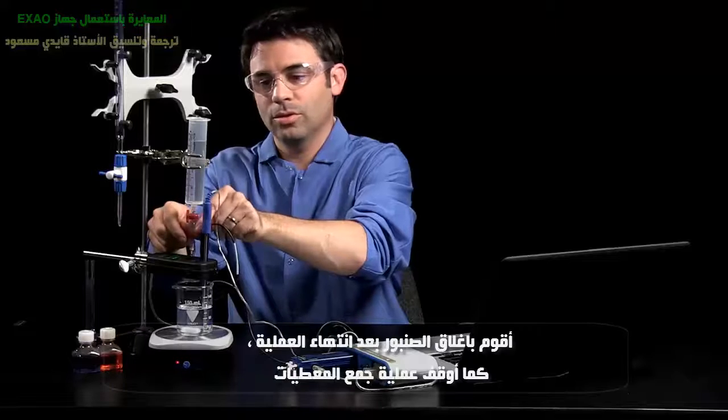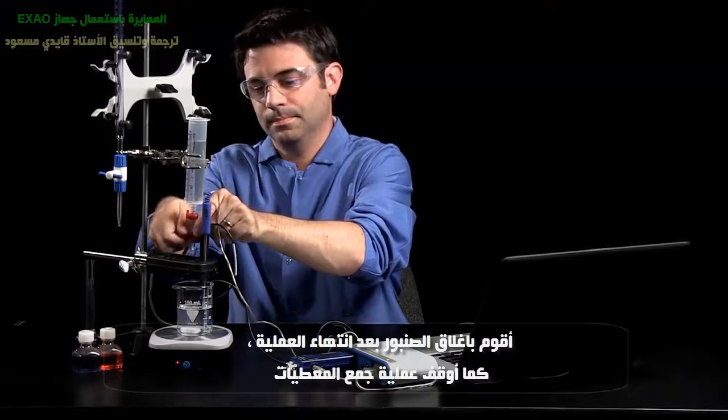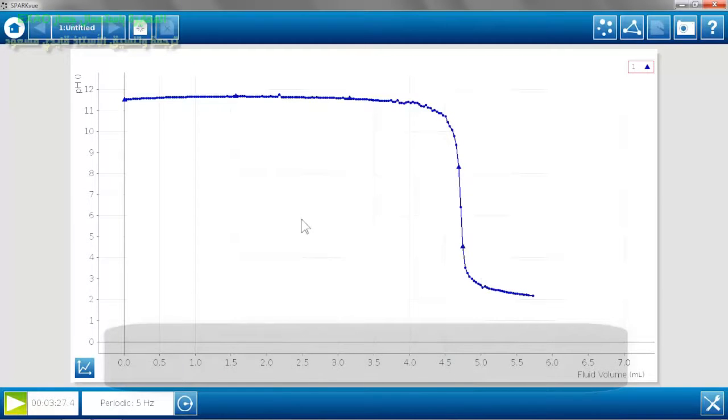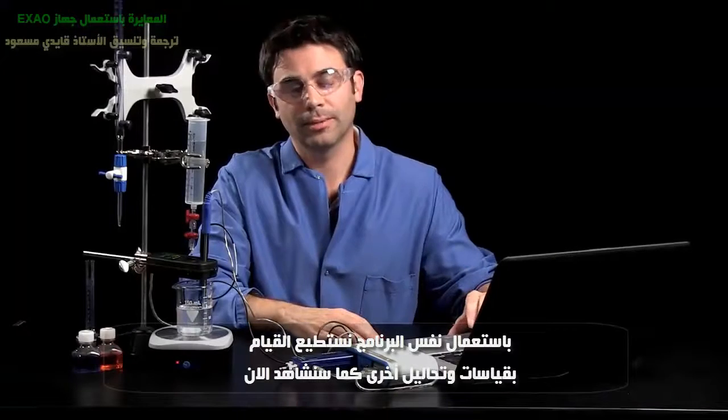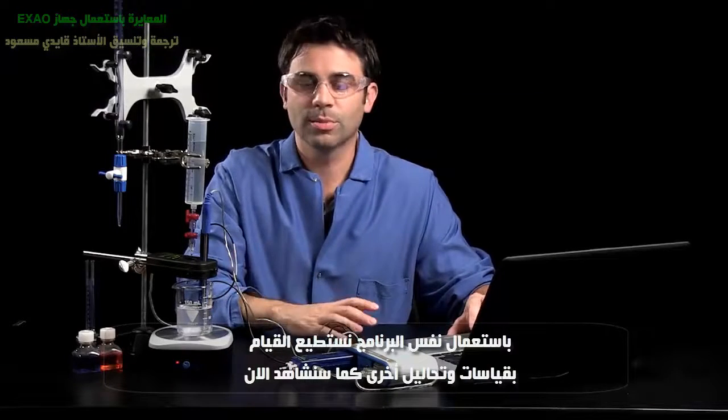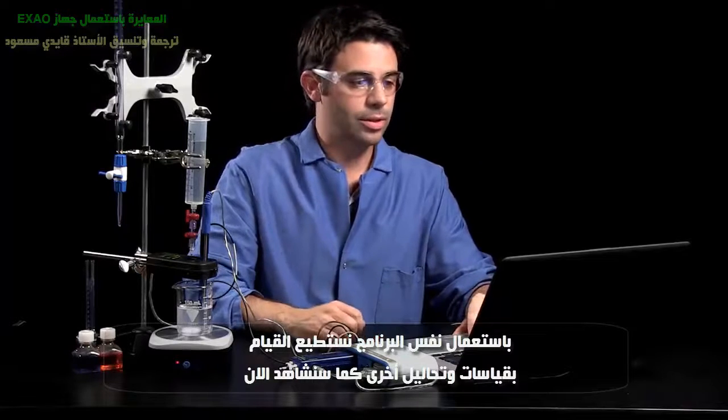I'm going to turn off the drop dispenser and stop data collection. Now we have a textbook example of a pH titration curve of a strong base with a strong acid. But we can go further — we can use the SparkView tools and our extra measurements to really analyze what's going on in the system.